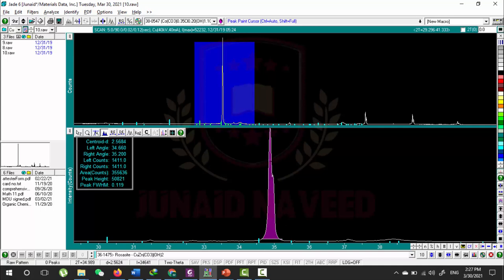It is popping up in the video. You can find this video from there. I have also explained different other toolbars in my different videos, so you can watch those videos and you may understand better what is happening here. We were talking about this tool. You see I selected from this point to this point, so it painted my peak.